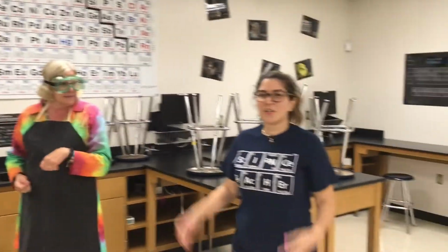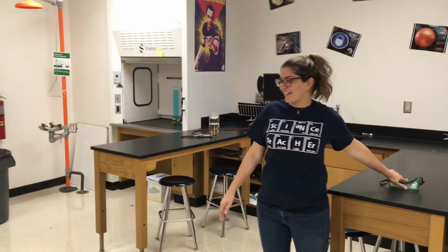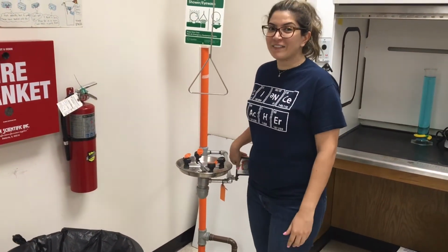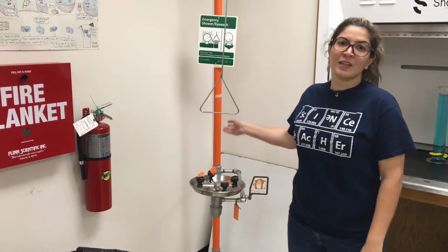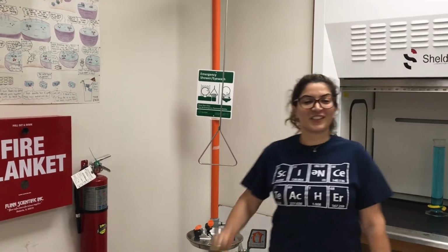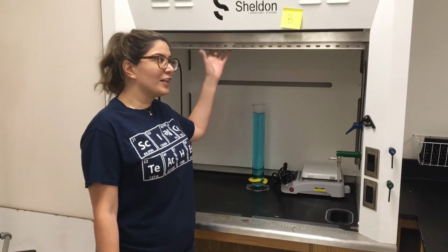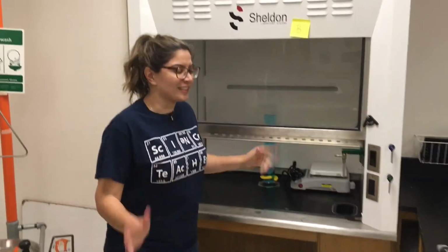And now, Ms. Kabani. You always want to be wearing your goggles in the lab, but in the event that something does get into your eyes, we have a very high-tech emergency wash station where you will have to immerse your face in this very cold water for about 15 minutes. If you have a large chemical spill, you are going to want to use the safety shower. Now we only use these in extreme emergencies, so we're going to try not to go here during the school year. For anything that is smelly or volatile, something you don't want to breathe in, we place our chemicals under what we call the vent hood. So this has negative air pressure and it will suck out any smelly substances.